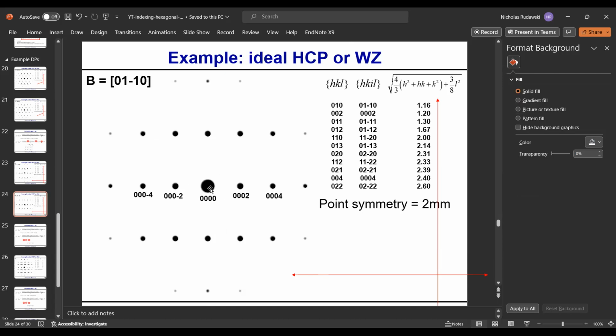If we figure out the lattice direction parallel to G1 and we do B cross that direction, we're going to get a G vector that points toward G2. That's one of the properties of the real space, reciprocal space lattice relationship.